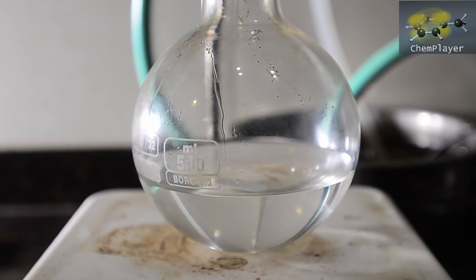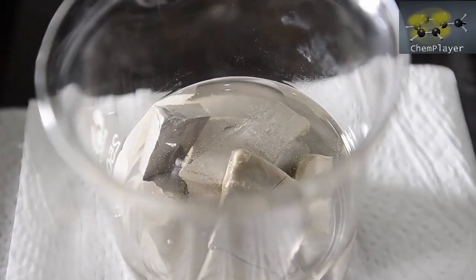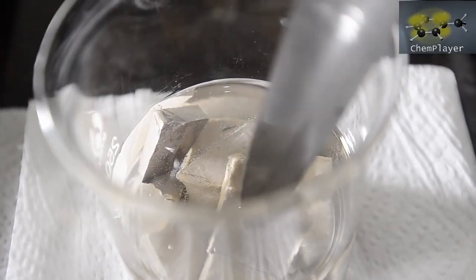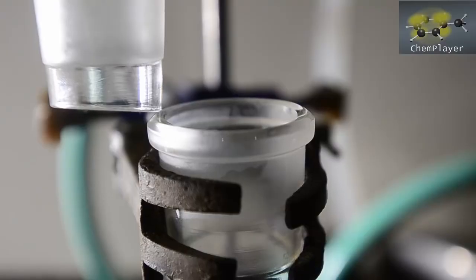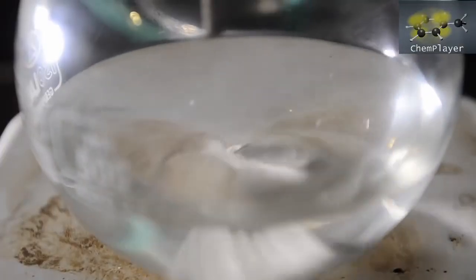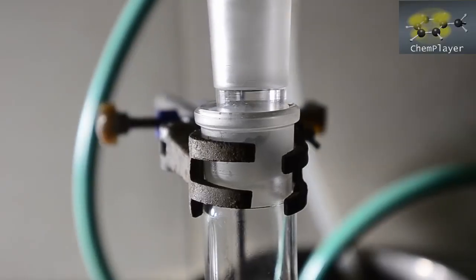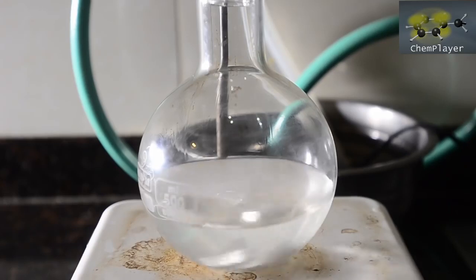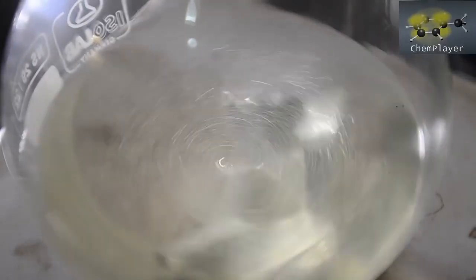Now we're ready for the fun part. Let's get a couple of nice big lumps of sodium. Dry them with a paper towel to remove the mineral oil as best you can. And it's showtime. Let's get a few more lumps in and then we'll get the reflux condenser on fast. It's very pretty to see the silvery shiny pure sodium metal exposed on the lumps. But as is often the case, with prettiness comes a mean streak.